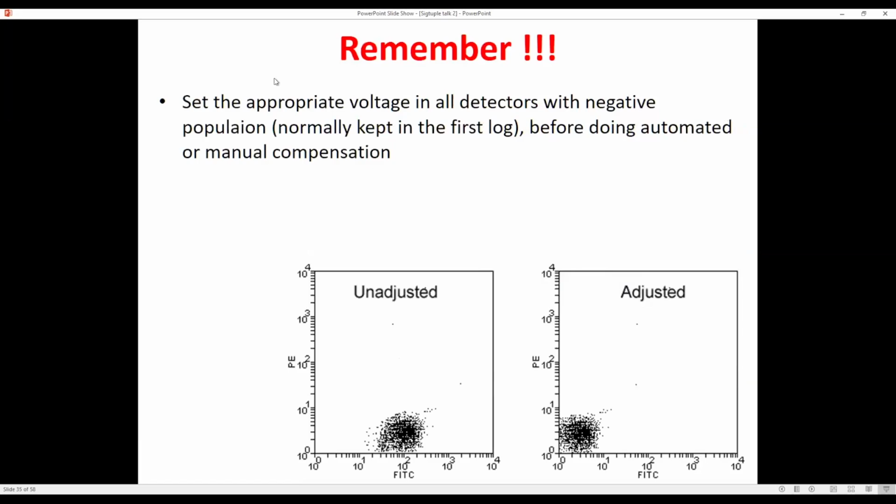I'll just tell you one small story. Some 5-6 years back, we took on a technician, and we were standardizing one experiment. It was a WASP staining for Wiskott-Aldrich syndrome. Actually, it was not giving signal. I was very, very disheartened. We were repeating many times. I was asking my technician to repeat it with multiple titrations and multiple processing methods, because I wanted to get this experiment done. The technician got very tired.